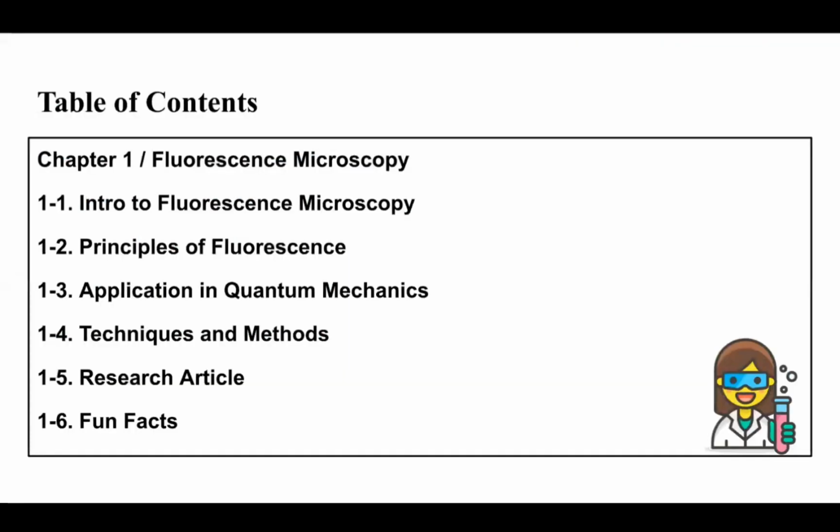This is the table of contents. Today we will be discussing fluorescence microscopy: the intro, principles, the applications in quantum mechanics, technique and methods, research articles, and some fun facts.